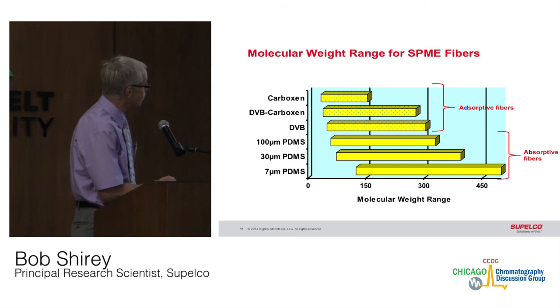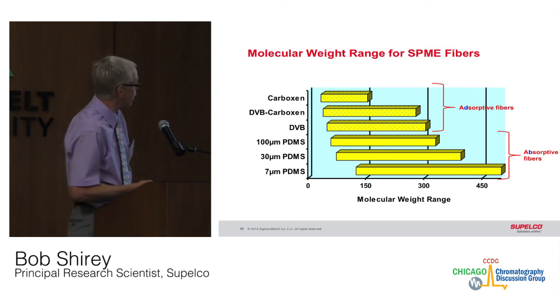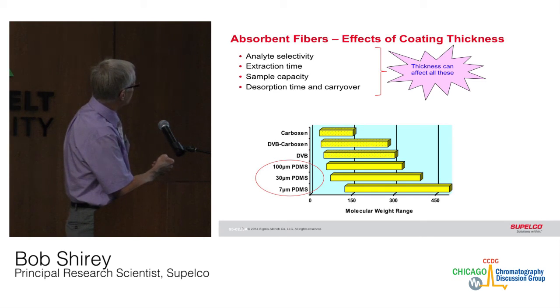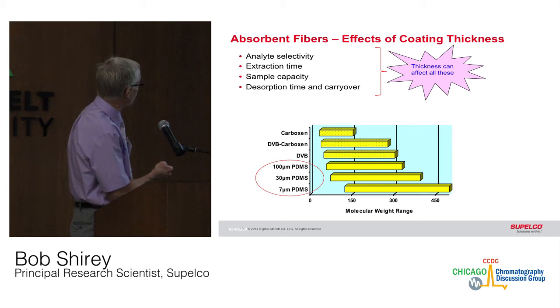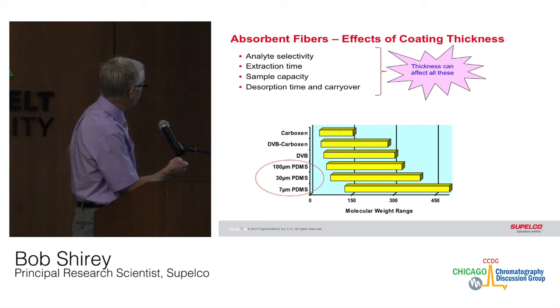Divinylbenzene has larger pores, so its molecular weight cutoff is about 50. And then when you get to the absorbent fibers, it's strictly, again, the thickness, with 100 micron having a molecular weight cutoff around 70, going out to a little over 300, where the 7 micron is around 140 and even higher than 500. So for the absorbent fibers, the coating thickness affects the analyte selectivity. Extraction time: it takes longer to reach equilibrium with a thicker coating. Sample capacity is better with a thicker coating, but carryover and incomplete desorption are an issue with a thicker coating.